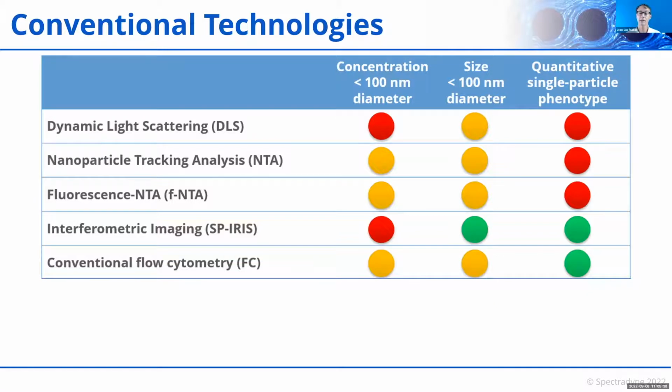And flow cytometry is a well-developed method for large particles in cells, but it hits the diffraction limit trying to use it to detect smaller particles. This means it's hard to detect those ones, and you have to assume optical properties of the particles to calculate their size, so it becomes a challenge to analyze heterogeneous samples.